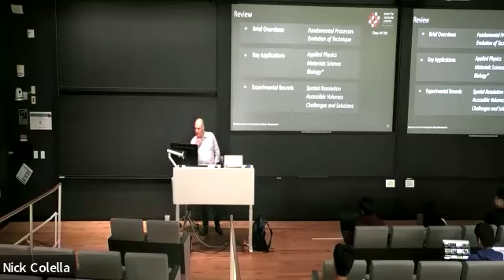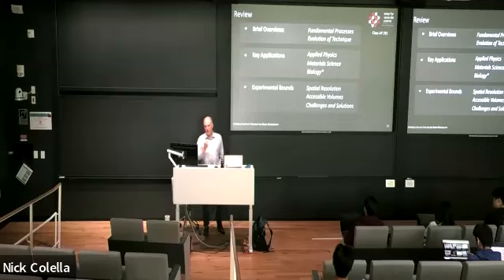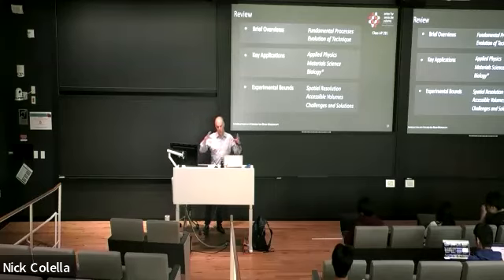So there was a question in the Zoom. How thick were the sections in the parasite example? So these were 20 nanometer thick sections, and the images were recorded with a 5 nanometer resolution. So this seemed to be a nice compromise that we do. If necessary, if we need high resolution, we can also make the slices, say, as thin as 5 nanometer, with the constraint that we need to make the volume smaller.